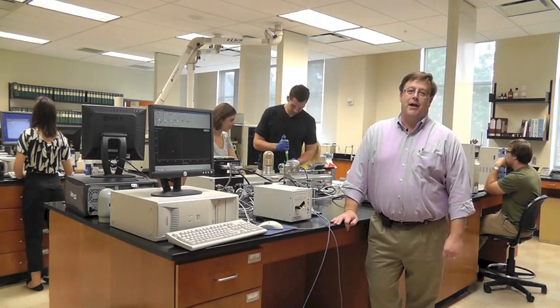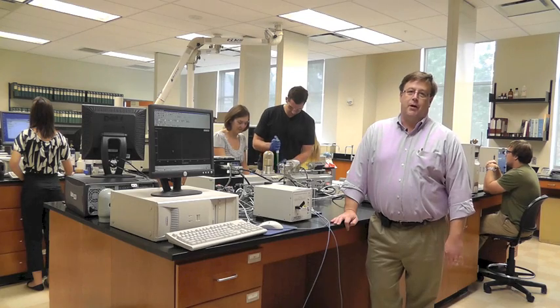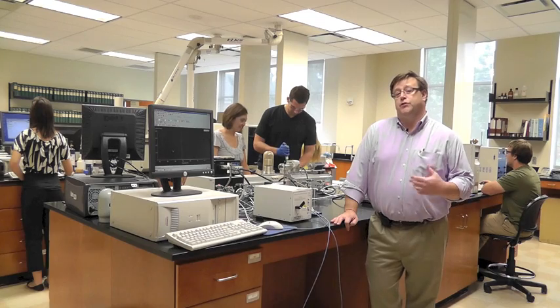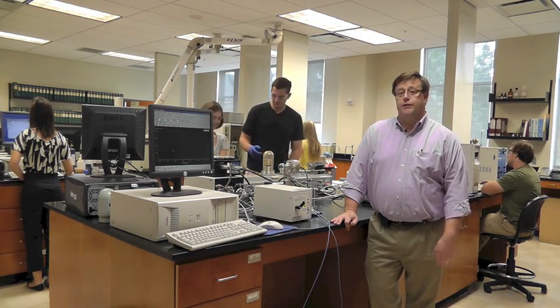Hi. Welcome to the Department of Chemistry and Biochemistry at the University of Mount Union. I'm Dr. Jeff Duraves and I'm Chair of the Department. What we're about to show you today is some of the instrumentation we have in our instrument lab that our students use during their research projects and during their coursework here at all stages of the curriculum.